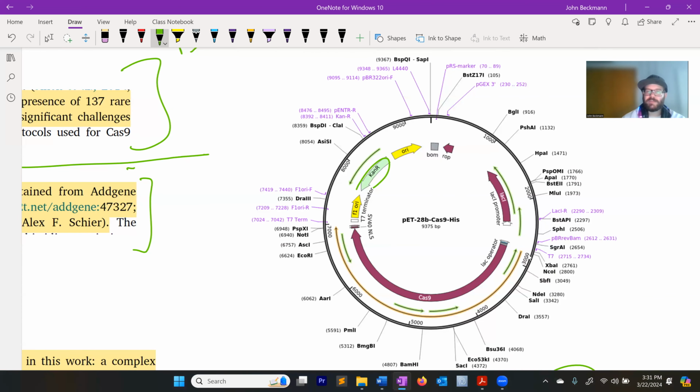So let's look at the plasmid. Okay, it's got a Cas9 insert. Here's the Cas9. It's got the lac operator right here. It's a little hard to read because the gene is upside down going this way, but the lac operator is going this way, which is what I said. It's already got one inherent promoter. And then here it's got a site that says T7. This is the second T7, the second T7 promoter. So it's got the double promoter annotated.